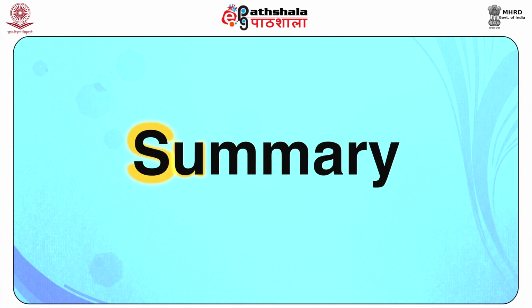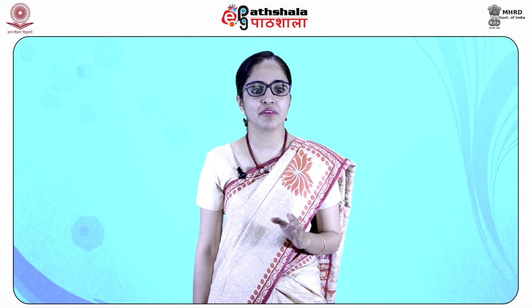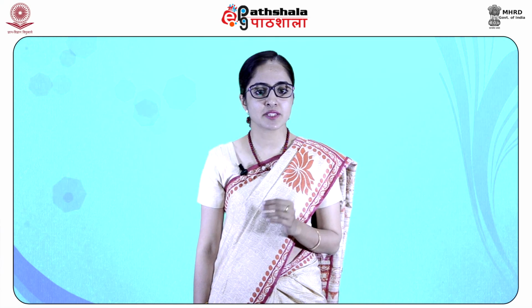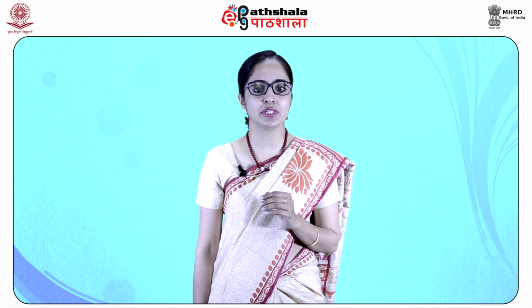Now students, let us summarize this module. We have learnt that there are two types of spectrometers. One is the continuous wave and the other is the Fourier transform spectrometer, and we have learnt in detail about their instrumentation. FT-NMR spectrometers are used nowadays because they take less time and give better resolution of the spectrum. It is important to carefully follow the steps while preparing an NMR sample.